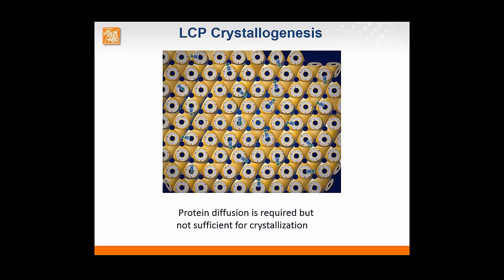There are two important facts about lipidic cubic phase. First of all, it provides a good mimic for the environment of biological membranes. Membrane proteins can be inserted into these lipid bilayers. And second, it has bicontinuous properties, such that both hydrophobic and hydrophilic molecules can diffuse continuously in three-dimensional space inside of this matrix. It consists of a single lipid bilayer that spans this three-dimensional space, dividing it into two networks of water channels. And there is continuity in both the lipid membrane and the water channels.